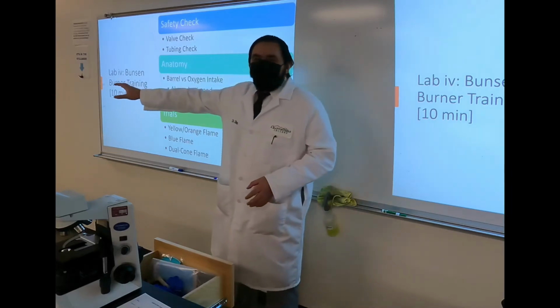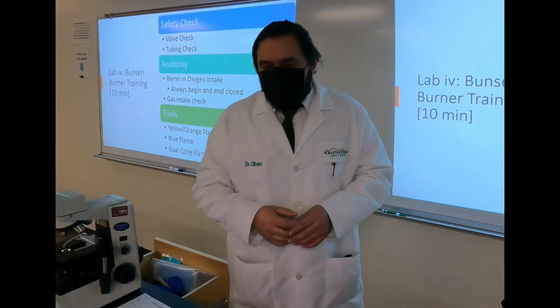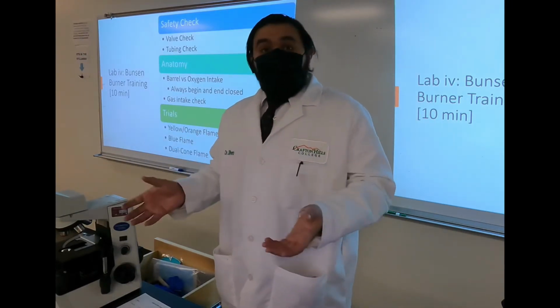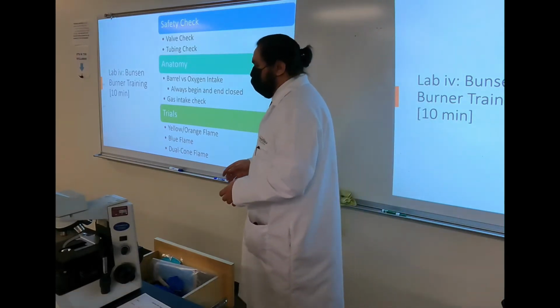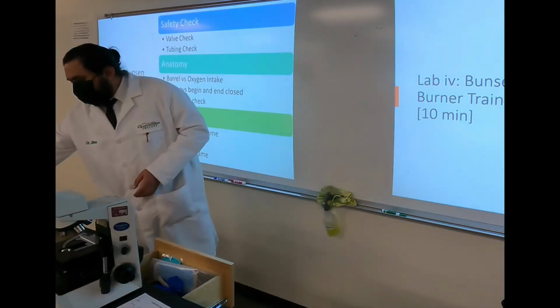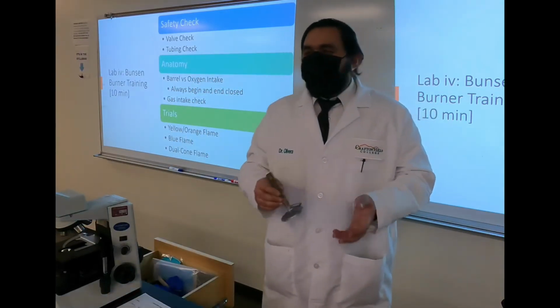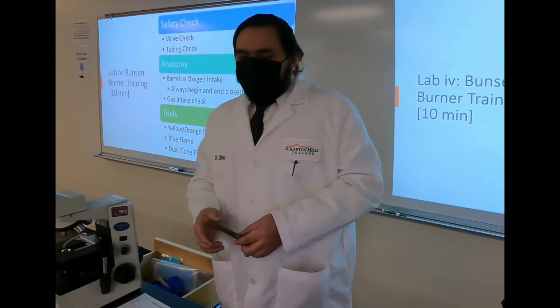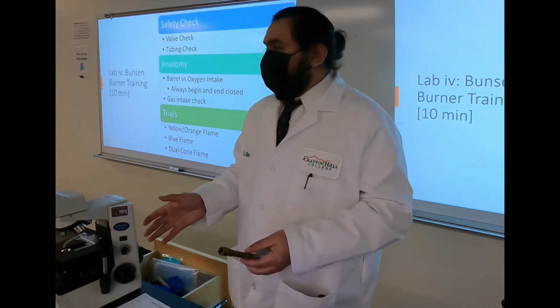Remember, you already had a video for this, I already played around, but there's a couple of things that we want to do. Again, back to the same rule that I'll use a lot of the times, trust no one. And this is always a fun one. This is what I love doing about this, is because since you don't know who finished, they've left in a rush, they weren't paying attention, one of the most common things is catching fire. Not saying that it happens, but it might happen. And the idea is trust no one.